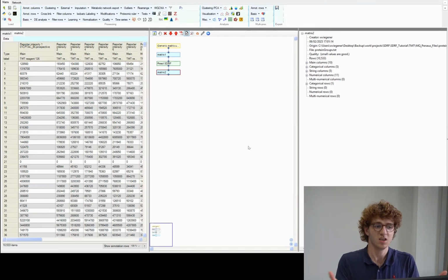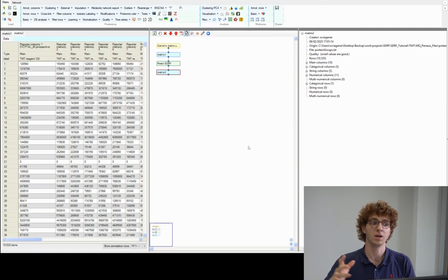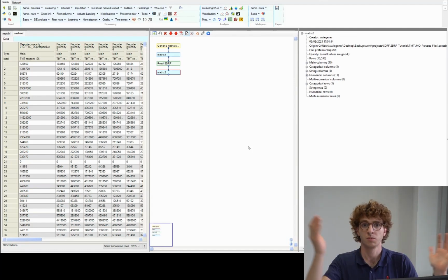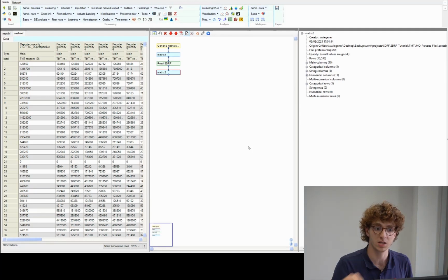So as you can see here, you only have the different TMT reagents that are differing between the samples. But of course, in a real life experiment, you would then have different disease, healthy control, whatever, different gender, different age. All that can be here. And if you skip repetitive properties, you will only see what's important, basically.